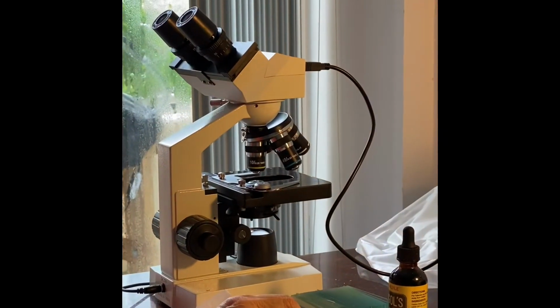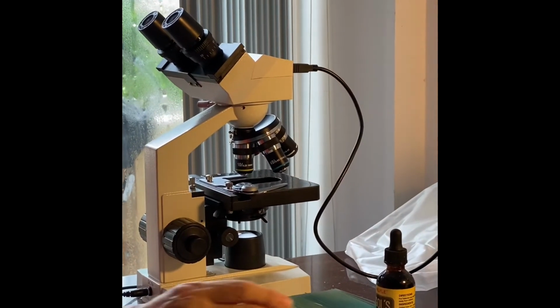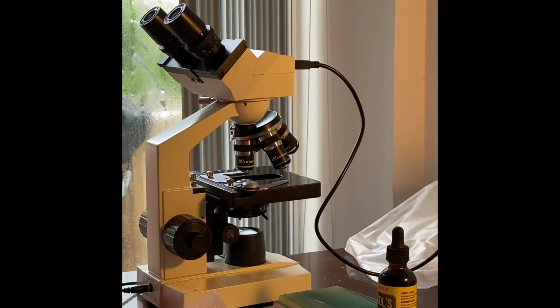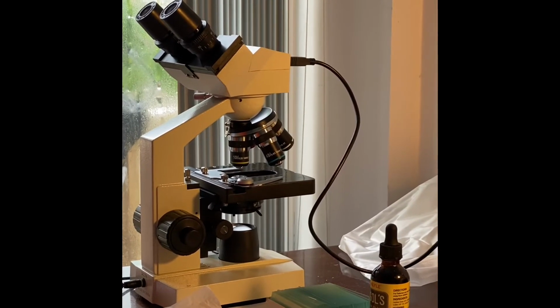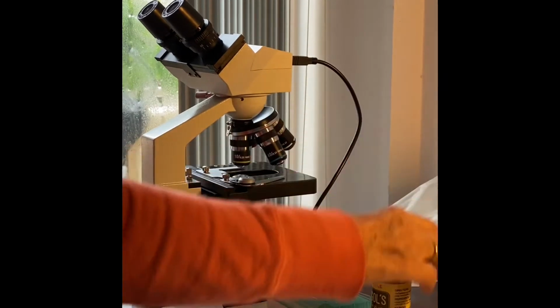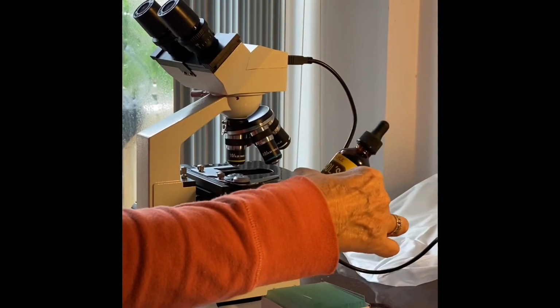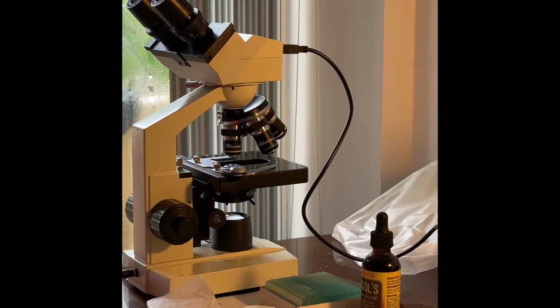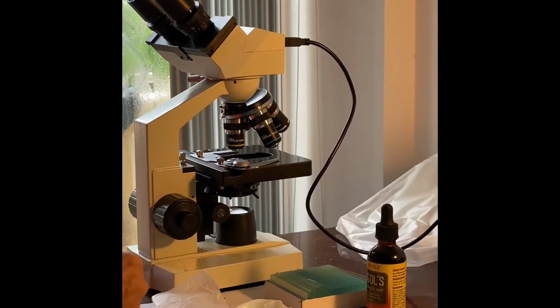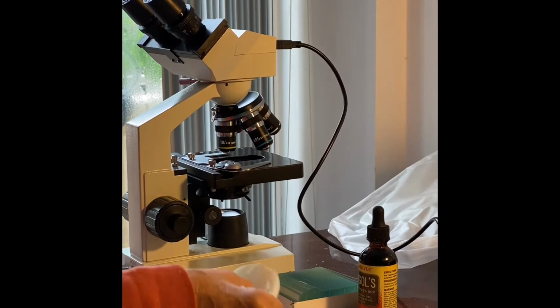You need to take out your materials for this experiment, and it includes your slides, the cover slip, Lugol's solution, which is going to dye the nucleus of the cell, and you need an onion.